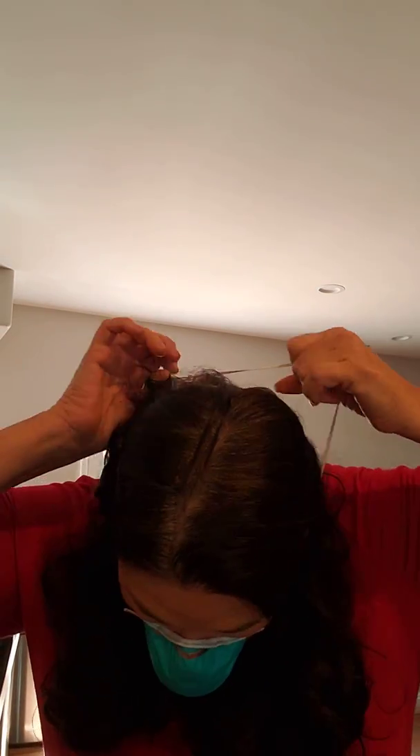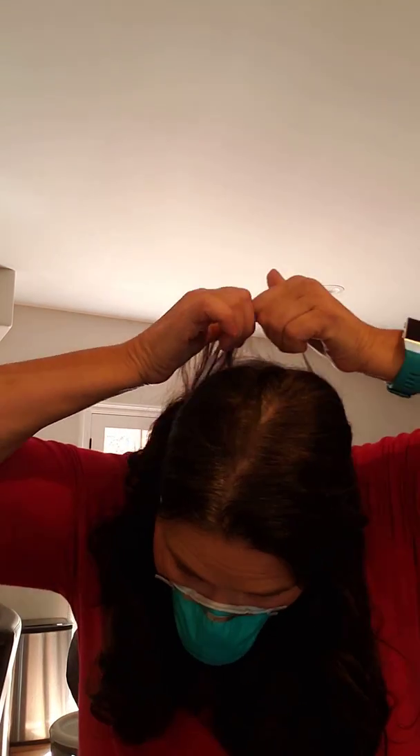Do not put your hand on the front of the mask to take it off because that whole front part is considered contaminated. After you've worn it, it's considered contaminated. So lean forward, grab the elastic bands in the back, pull them over your head, and let the mask drop. That is how to properly remove the mask — do not touch the front of the mask because it is contaminated.